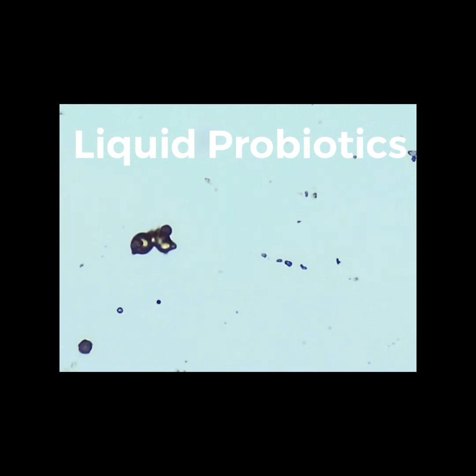Now we have a fermented liquid probiotic. We simply took the pipette, grabbed some of the liquid, mixed it in with water, and looked at it. This is also at 40x magnification. You'll see cell formations on the left — that big glob of brown is likely plant cells as well. There is energy; you can see some glowing. You also don't see as much movement, and that's because the archaea are not present. The archaea are what amplify and light up the underworld.